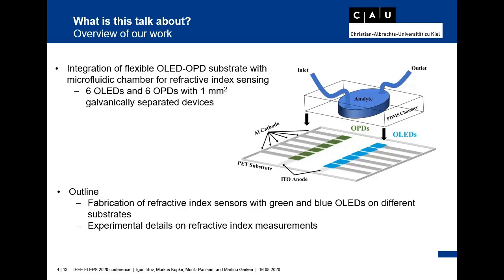One of the great advantages of integrating the organic devices monolithically is the alignment of the devices. Due to the use of shadow masks and the thermal evaporation technique, the fabrication of the OLED-OPD devices is quite simple, and that holds great potential to fabricate the devices compact, miniaturized, and with a low alignment deviation, which results in a high reproducibility of the samples. These devices can be used for monitoring of multiple analytes by operating the pixels separately or in groups, and can be used as reference signals or for the redundancy approach.